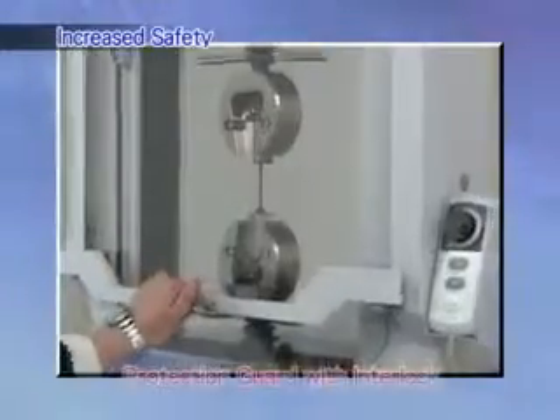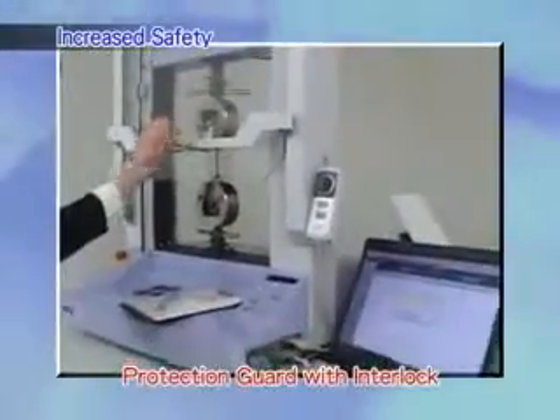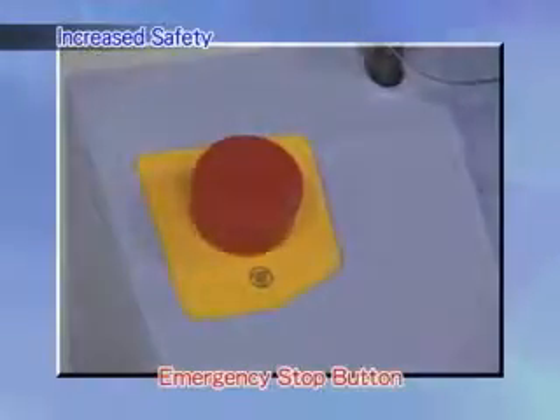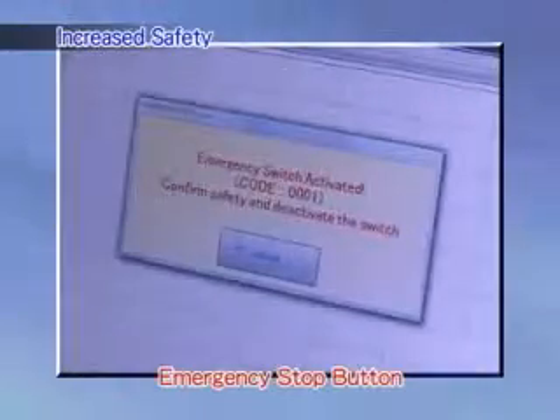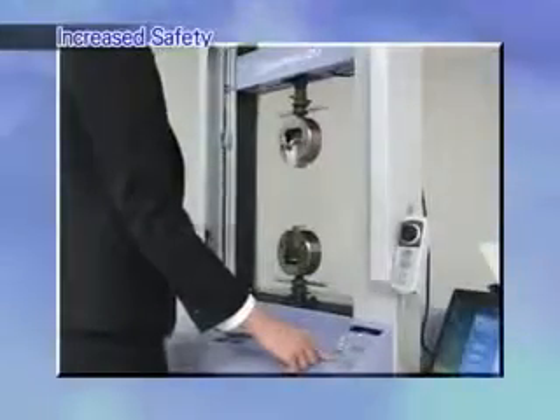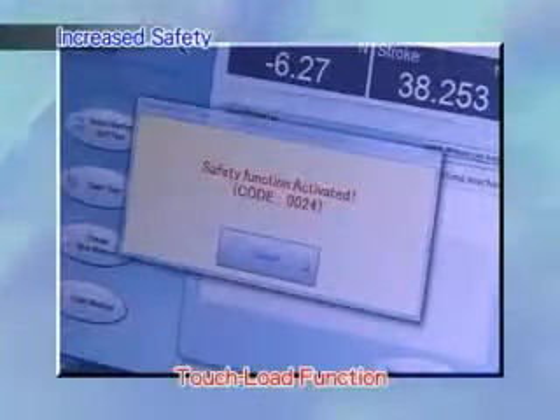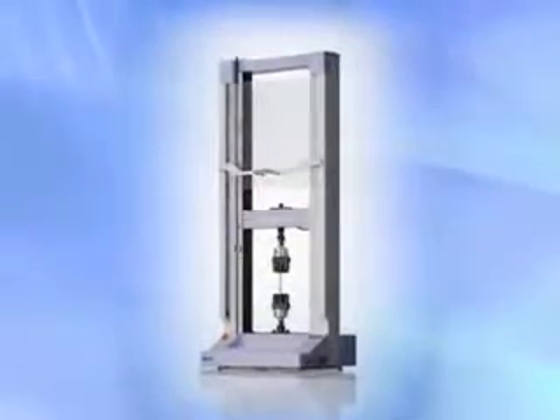Increased safety. The AGSX offers an interlock equipped protection guard to protect against flying debris. Easy to access emergency stop buttons, and various other features such as the touch load function, ensuring that the system can be used safely by anyone. The AGSX — now more convenient to use. Find out more about its new features.